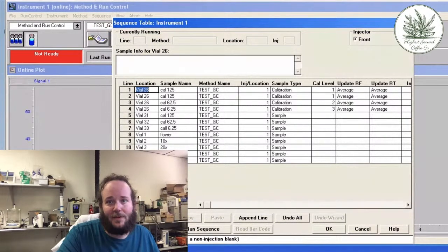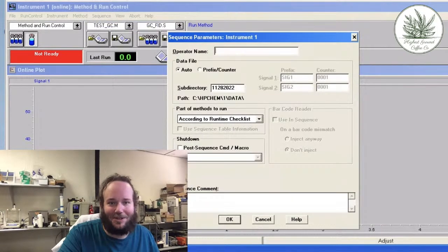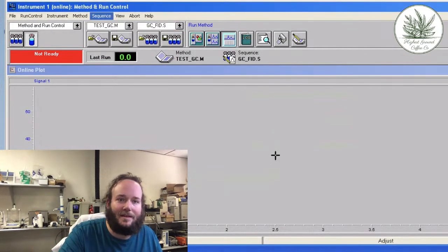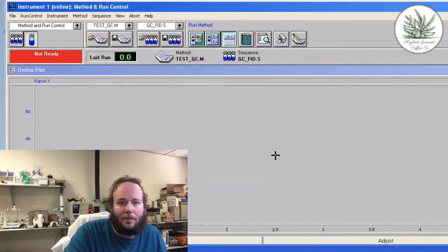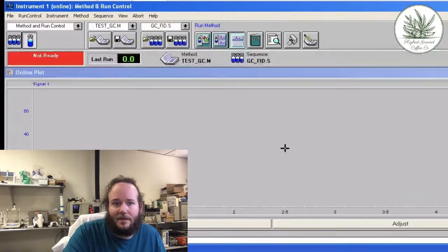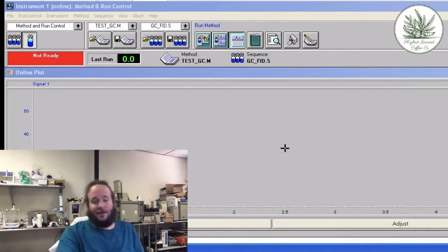All right. So this is what I'm going to do. This is so frustrating. So it should say that we're ready. Not sure why it doesn't at the moment. So I'm just going to reload the software. One of the things about this old software is it really does follow the ideology of, okay, well, if it doesn't work, just reboot it.